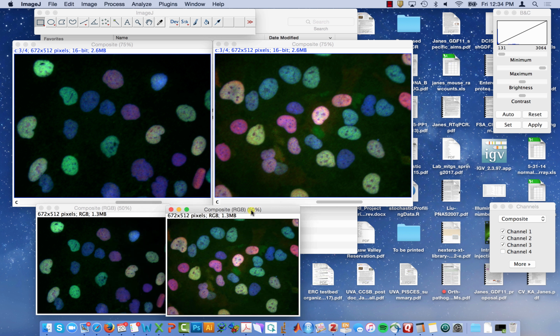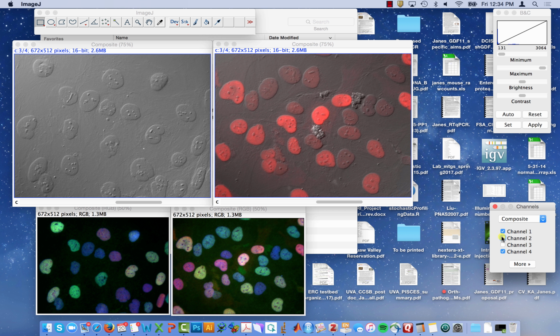For the purposes of demonstration, I will now take these all away and just have a grayscale individual image.